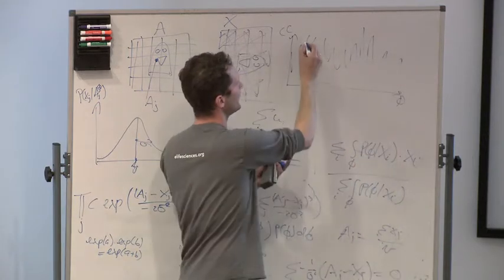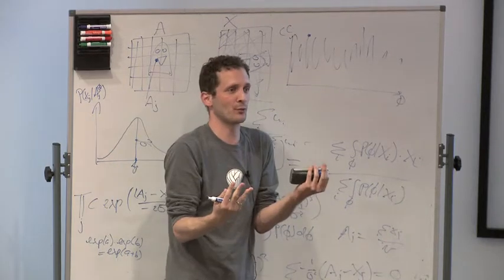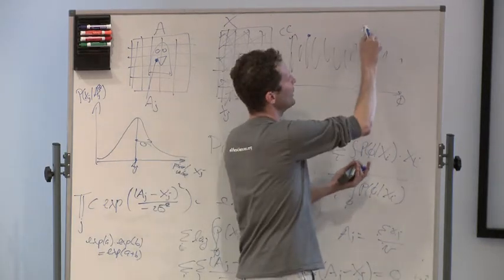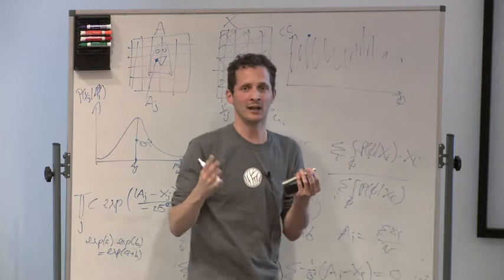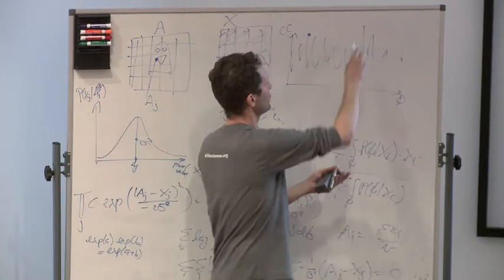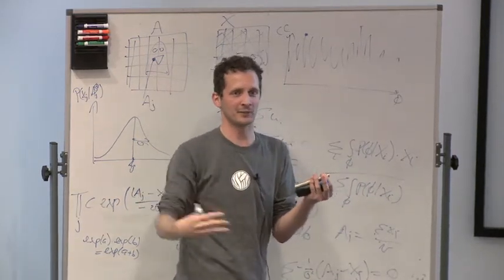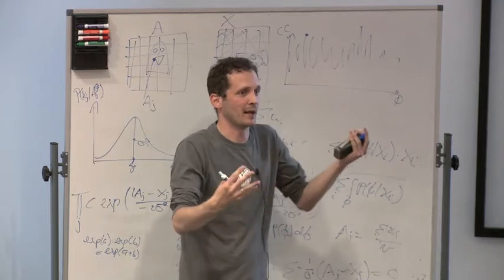And it could be that this is the true orientation of that image, but just because there's so much noise, this happens to be a slightly higher cross-correlation value. And if you then do maximum cross-correlation, what will happen? You'll just assign a wrong angle, okay? Hopefully it will get better as your reference gets better and you might get away with it, perhaps not.